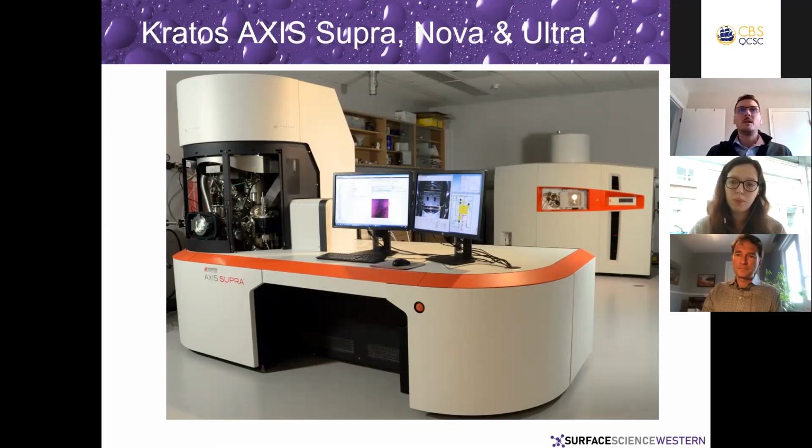Everything's fully automated. It's been pretty handy during the pandemic. I can go in, load samples up on Monday morning, and then run for a couple of days from my office here in the lab or in my house. So it's kind of handy that way. You can do everything by remote control.